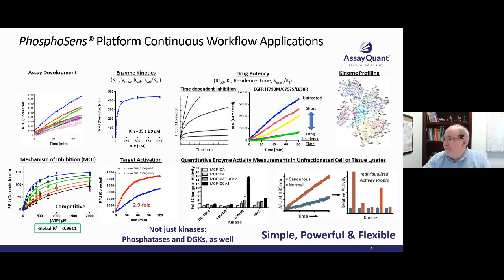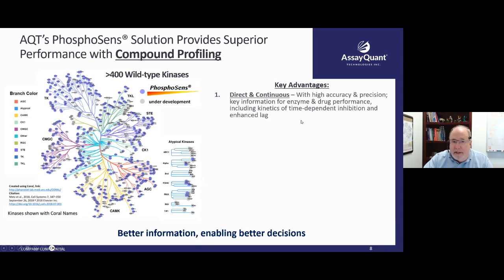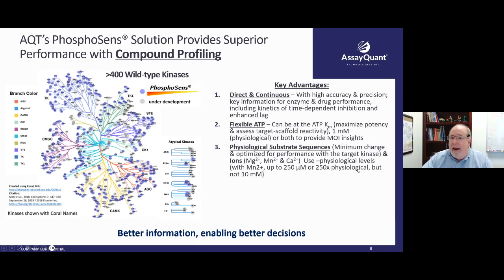So yes. Fantastic. Can you talk a little bit about the advantage of performing kinome profiling at 1 millimolar ATP versus ATP at Km? Certainly, yeah. Kind of address that a little bit here. But yeah, at Km, there's two schools of thought here.